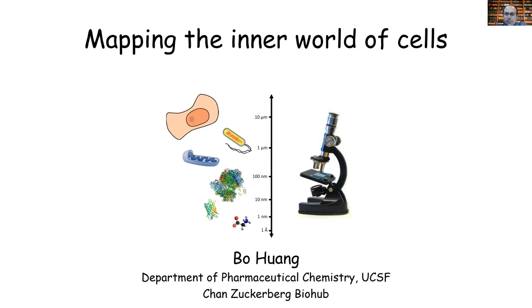Cool. As people are asking, I have a quick question, Bo. What if you also combine multispectral imaging, like 20-channel live movies, into your platform? Would that work? So you're talking about spectral imaging to image many, many channels? Absolutely, yes. The challenge is to get that many different colors on live labeling.